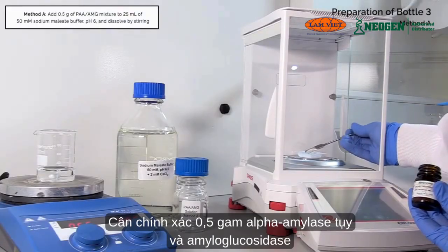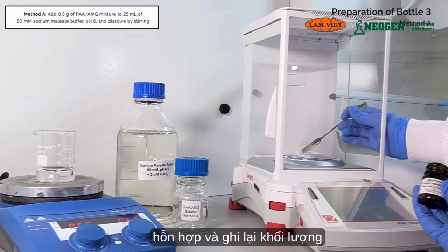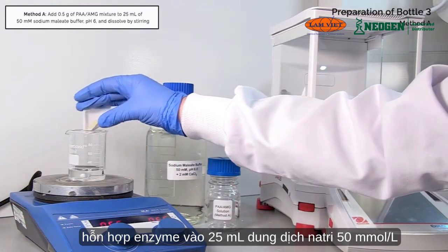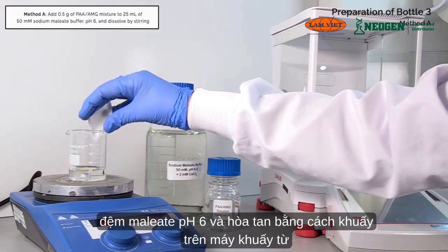Accurately weigh 0.5 grams of pancreatic alpha amylase and amyloglucosidase mixture and record the weight. Add the enzyme mixture to 25 millilitres of 50 millimolar sodium maleate buffer, pH 6, and dissolve by stirring on a magnetic stirrer.